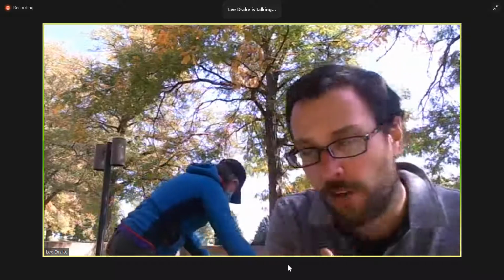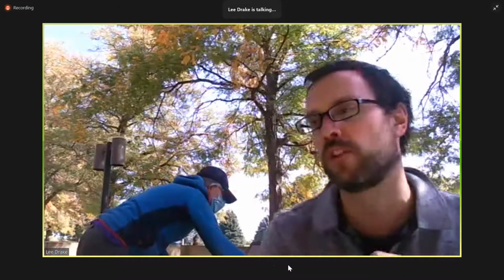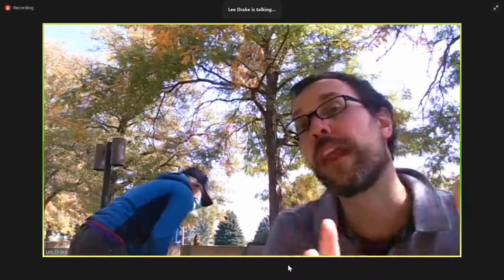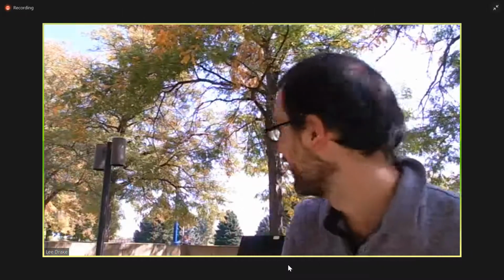And then for sulfur in particular, you're going to have to look at the width of the line, not the height of the line, because of its overlap with the lead M line. Hope that answers your question, but it is doable. It is doable. I'll pull that over so you can see if any more questions come.